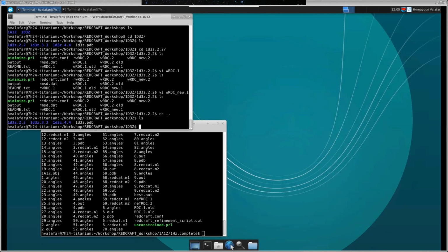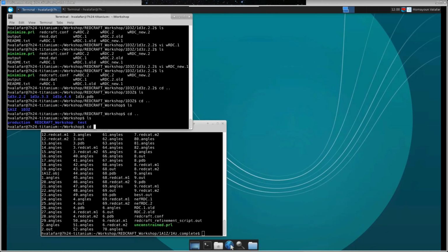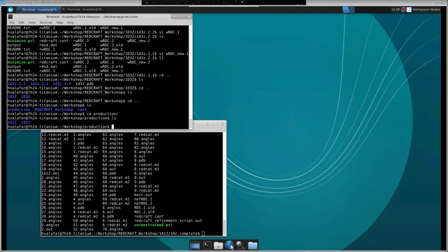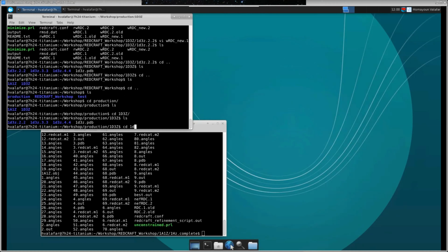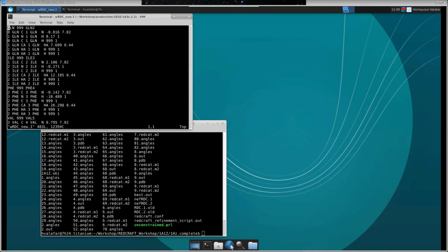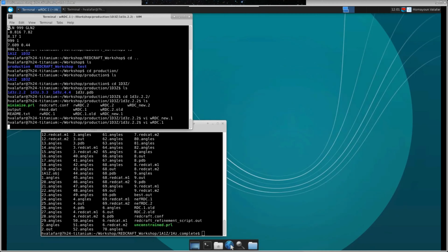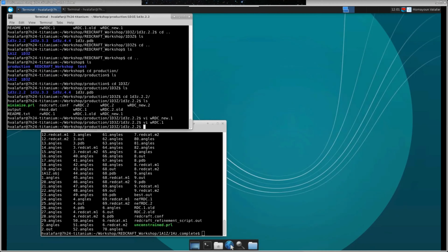Okay, so I'm going to go to my production. Let me see if I have it there. There's a bit of a mix up here. This is supposed to have only 2 RDCs, but it actually has 3. It works with 2, take my word for it. I don't know why. Okay, so somewhere I screwed up the process of copying data over.